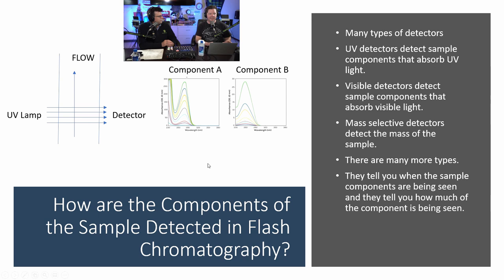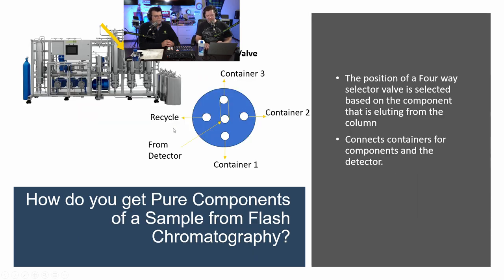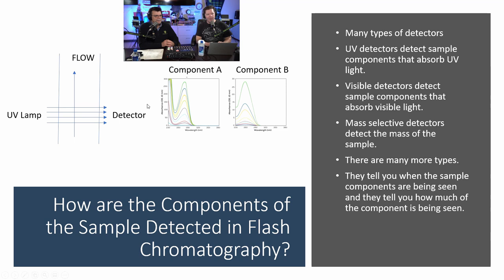The UV lamp is the exact same thing. As the sample comes through, the UV lamp is beaming through the tube, and there's a little detector over here. When absorbing compounds come past this, it says, oh, I see it. There it is. Look at that. And it comes, and then it leaves. Because it's flowing, it'll start, then get bigger, and then it'll get smaller. It just registers what it's seeing from the UV lamp to the detector.